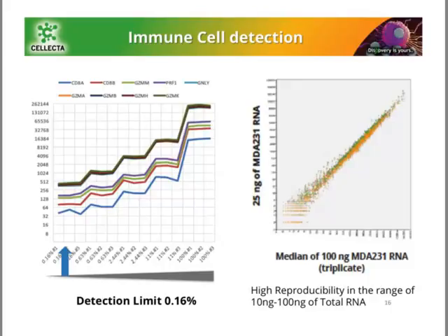On the left, like I mentioned, cytotoxic T cell is a 60 gene signature. But here, just to represent it, I've used about 9 genes as representative data to plot it in a different way. This experiment is an admixture, where we added FACS-sorted cytotoxic T cells into the mix of all other cells and tried to see if this DriverMap platform can pick it up. So you can pick it up at low levels. The signal to background becomes better as the concentration of this cytotoxic T cell increases.